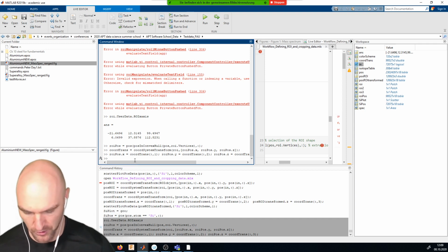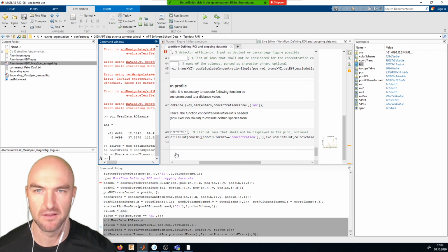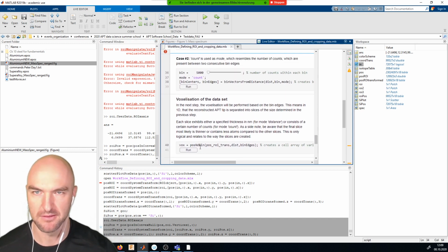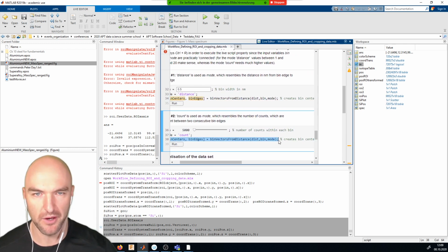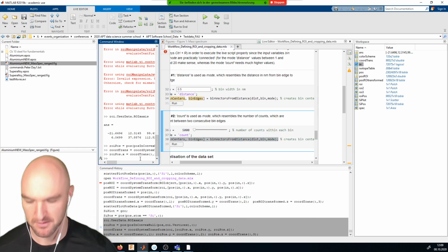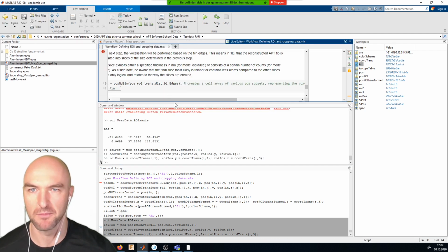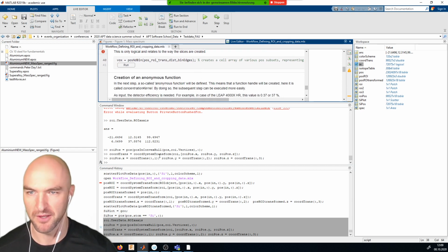And so now what we need is, we need essentially to create bins. And so we want to create bin vectors from distances. Maybe I can put them above each other. I think that might be the better way to go about this. So then you can see both things at the same time.